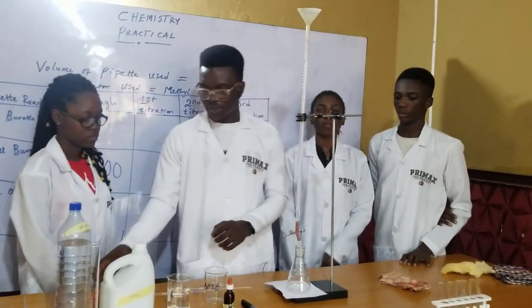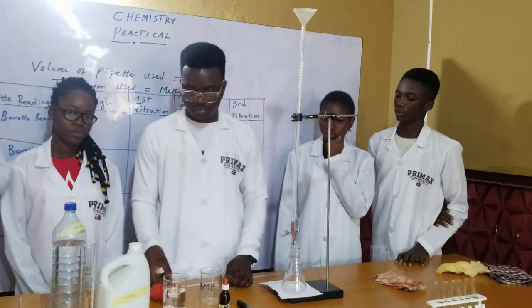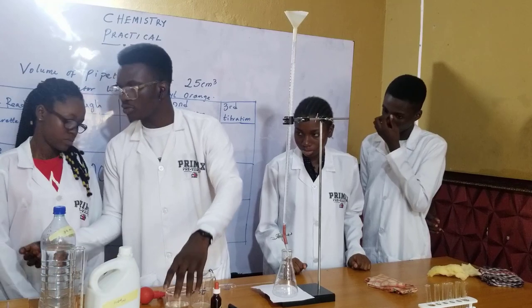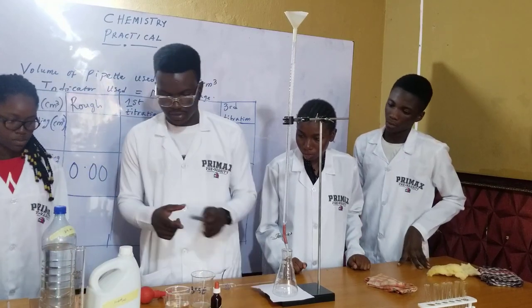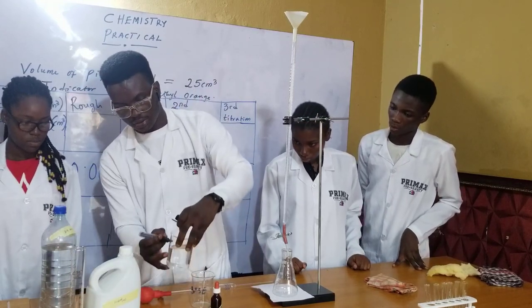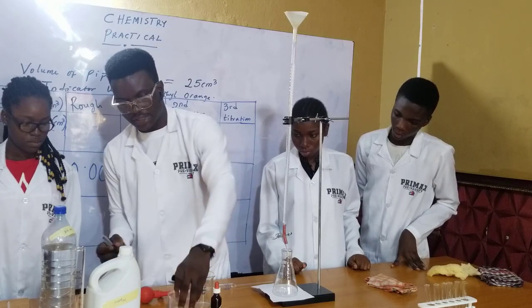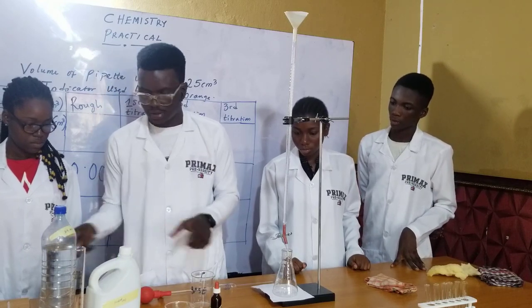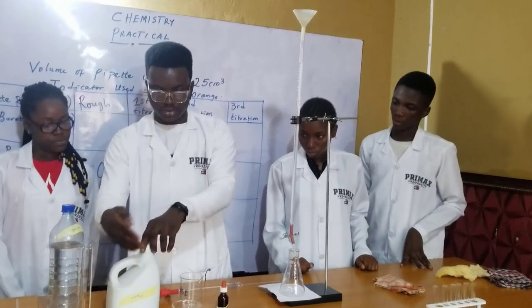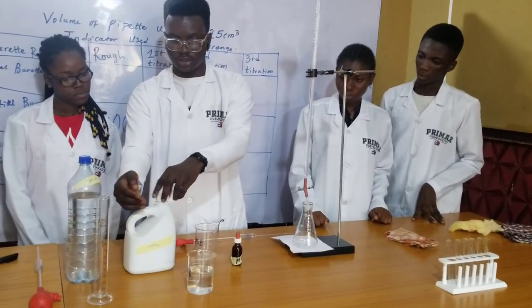Now let's pipette the base. In pipetting the base, don't forget to label your solutions — that's our acid, that's our HCl. We use the beaker only to hold the liquid. We have our base here.